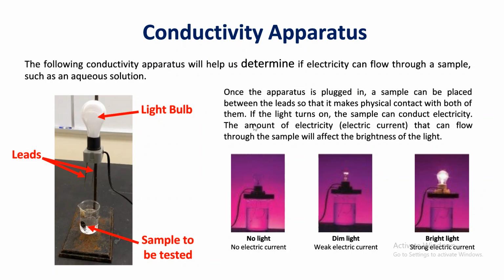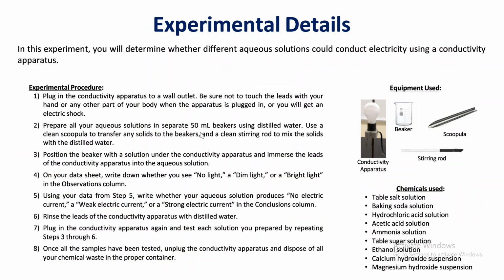The amount of electricity that can flow through the sample will affect the brightness of the light bulb. So the experiment here: we are going to determine whether different aqueous solutions can conduct electricity using this conductivity apparatus.